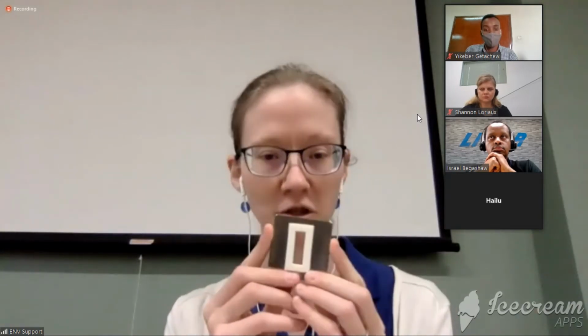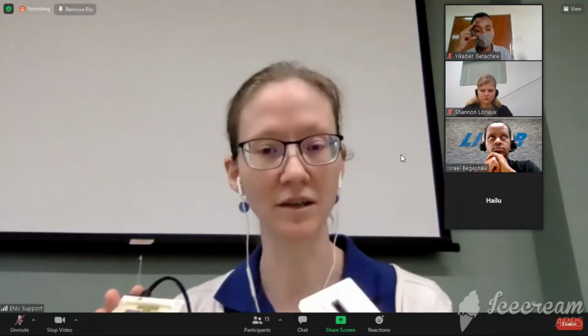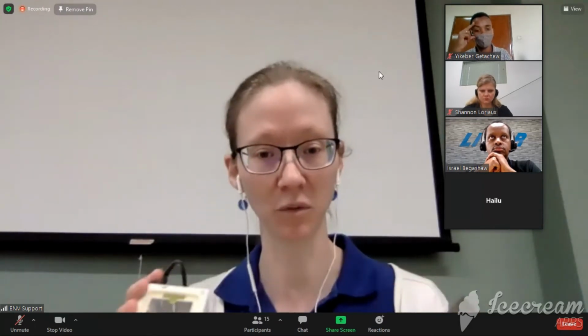I also know that some of you have the 2x3 chamber, and so the 2x3 chamber can be this one, which I think we showed yesterday, but I'm going to show it again. And I'm going to show it in comparison to the size of the light source. So if we had the entire chamber aperture, the 3x3 aperture available, it would be the same size as this light source, slightly smaller, but about, and then instead we can use this. We also have a 2x3 aperture, meaning that it is somewhere between these two. We have a 3x3, a 2x3, and a 1x3.